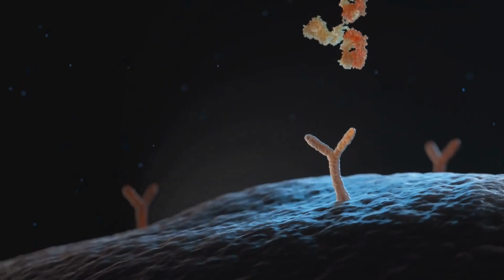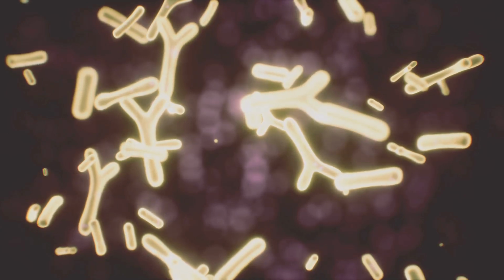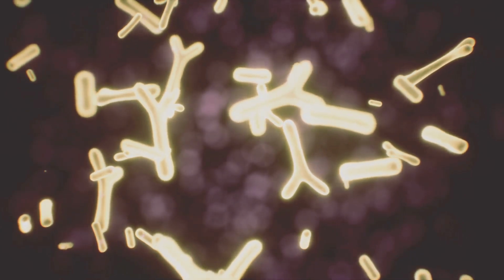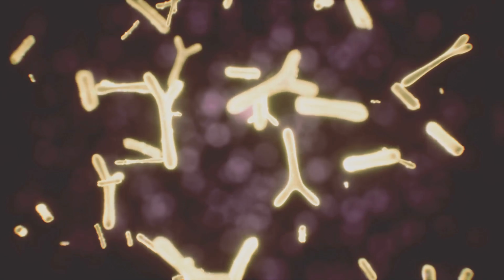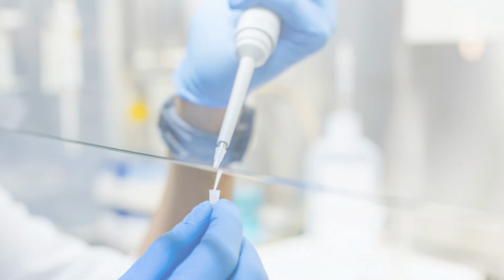This is where fluorescent antibody labeling, or FIA, comes in. FIA is a revolutionary technique that empowers scientists to visualize and study biological processes in unprecedented detail. It is a cornerstone of modern biotechnology, with applications spanning medicine, agriculture, and environmental science.